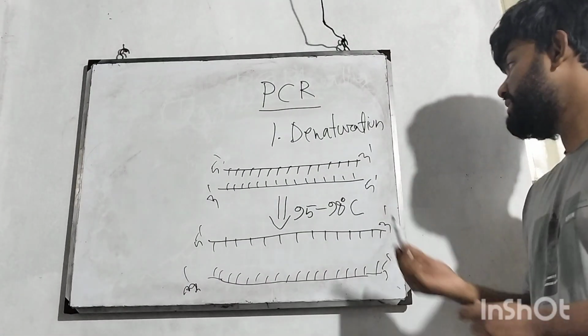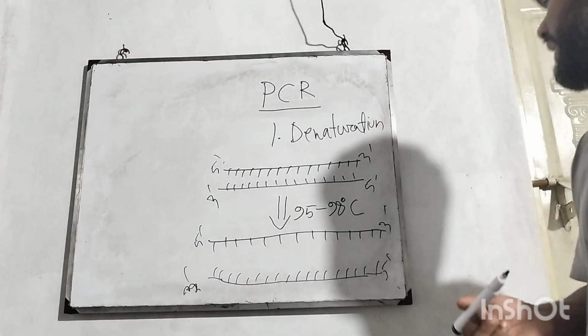So this happens in the denaturation step. Then what happens?